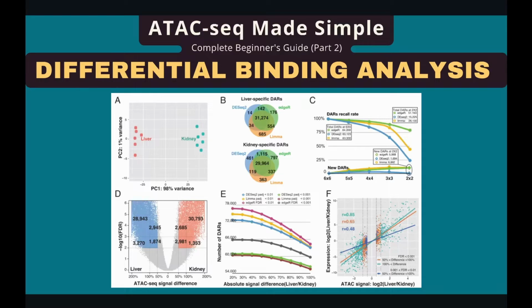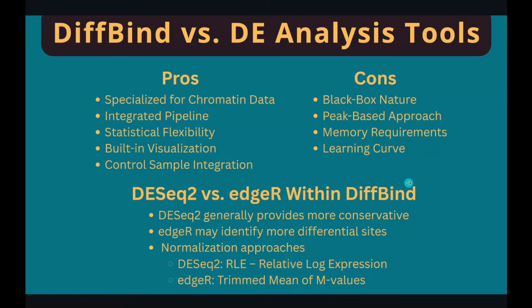So in this tutorial, I'm going to show you a new way that integrates all the analysis in one package, from differential analysis to annotation to enrichment analysis and then to visualization. The new method relies on one R package, DiffBind.